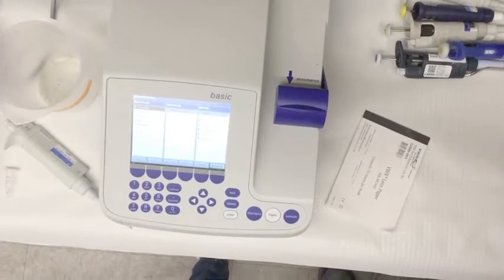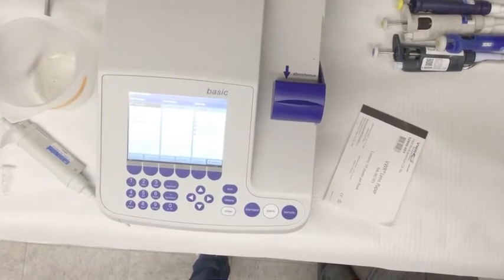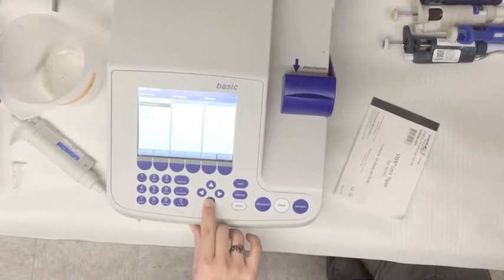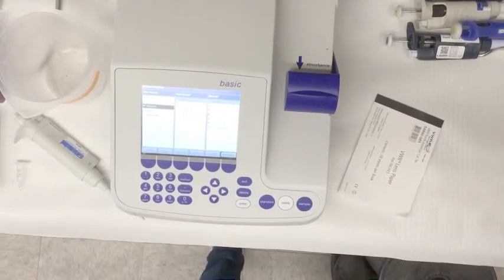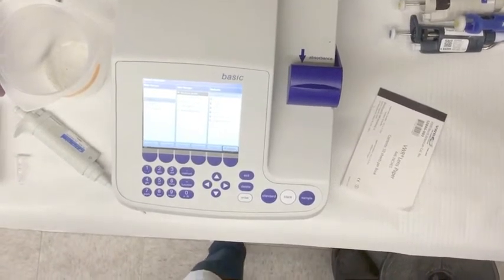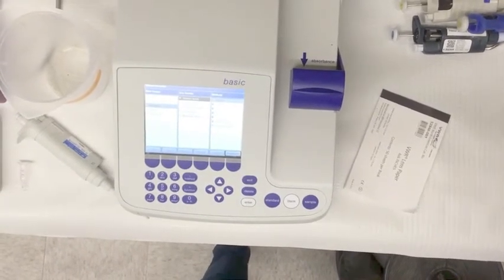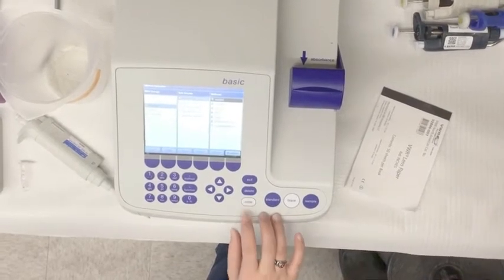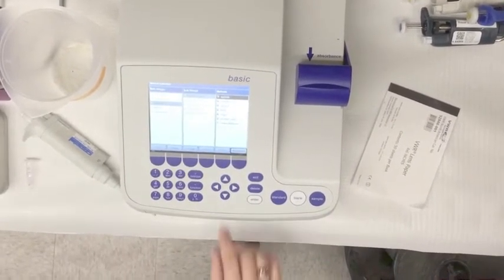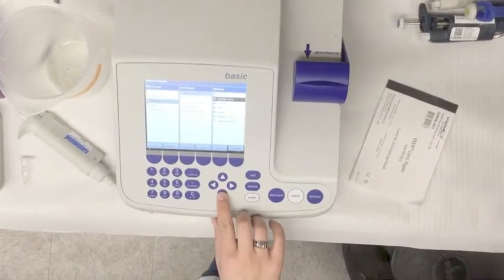After the machine has turned on, select Main Groups. Move the arrow down to select Routine, and press Enter. Under Subgroups, move the arrow to Nucleic Acids, and then press Enter. Under Methods, move the arrow to dsDNA 1 mm, and then press Enter.